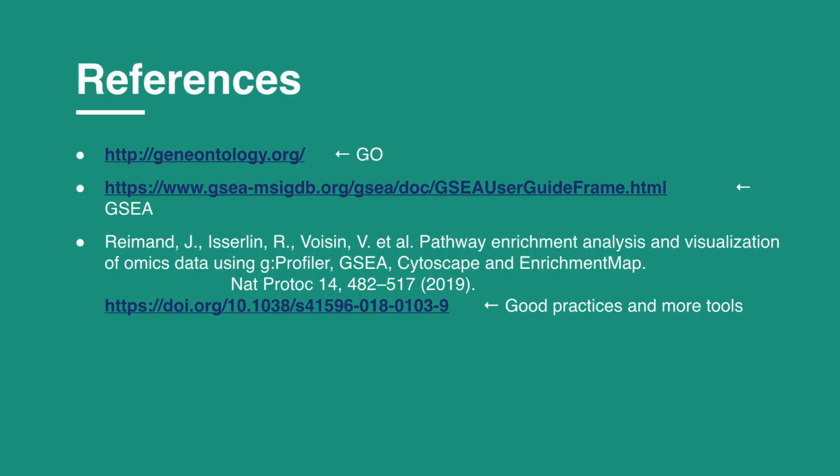And I'll leave you with some references for the gene ontology homepage, as well as the GSEA documentation, which is really comprehensive, and this nice article that has good information for good practices and other tools you can use for pathway enrichment analysis.